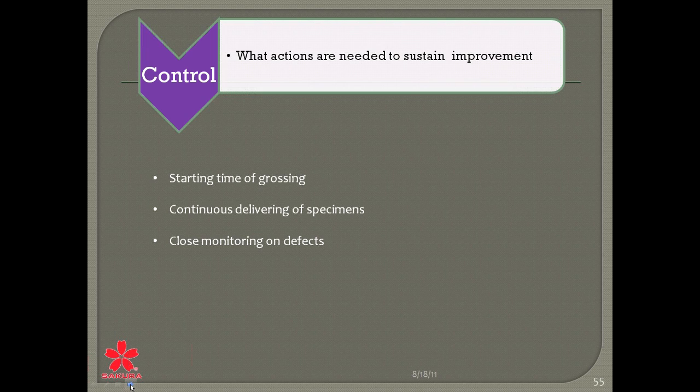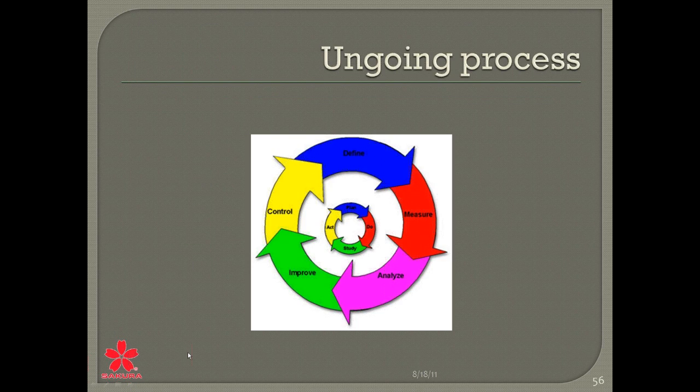And what we also did was close monitoring of defects like chatter, and why tissue is not processed well, and the fixation. There are always a few problems that you have, but you really need to monitor them, and we tried to do it. So it went really well.